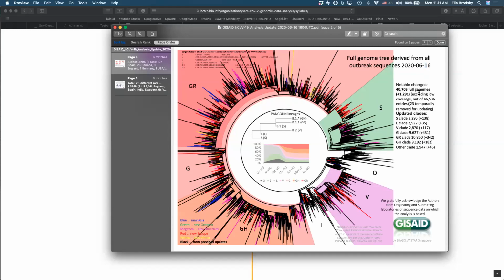Okay, so next time we'll take a look at the results in general, but also we'll take a look at some of your pipelines so that we can understand how those pipelines can be interpreted and what they tell us in terms of the differences in the genomes of SARS-CoV-2. So that's for next time. For today, any other questions I can answer about the analysis that we did today and about finding those sequences on NCBI Virus?